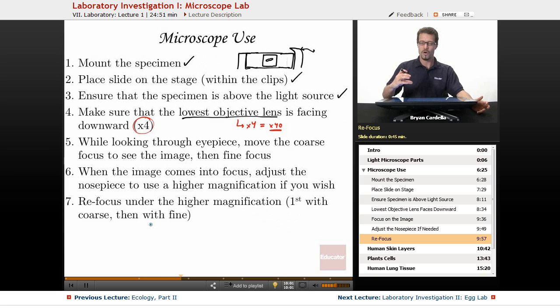Always go a little bit with the coarse. Once you've actually moved the stage to the right location, usually you don't have to move the coarse focus that much. Just a little bit, just to fine tune it, and then fine focus. You can move freely back and forth, and it's as if you're looking at very tiny cross sections along the cells. Sometimes if a tissue is a little thicker than one cell, when you move the fine focus, you'll actually start to see the top of the tissue come into focus, then the bottom of the tissue come into focus. It's pretty fascinating how you can zoom into very specific parts of tissues by using the fine focus while you're looking through.